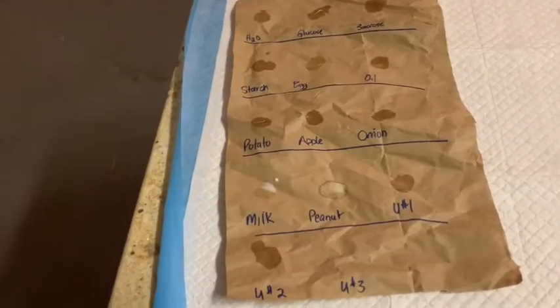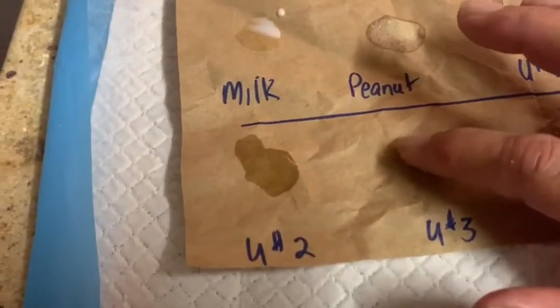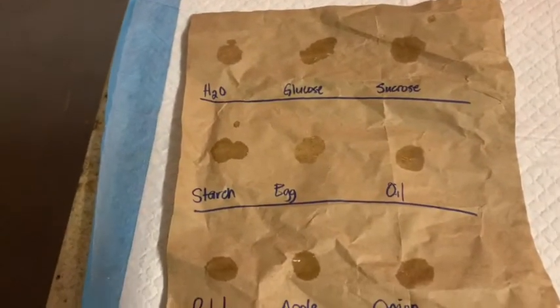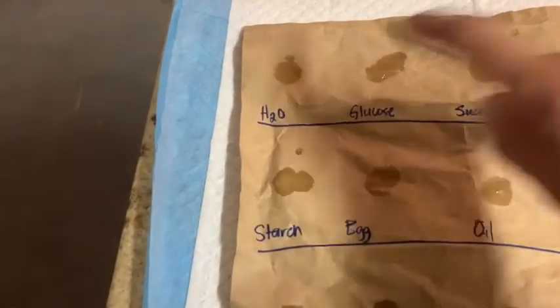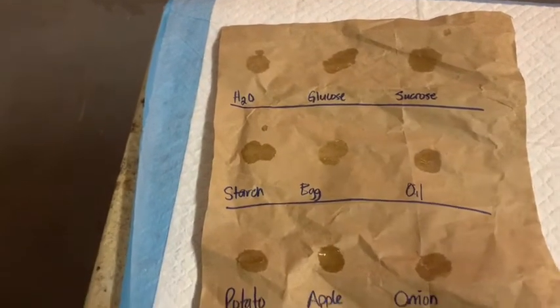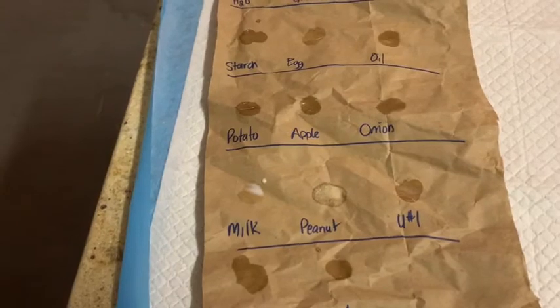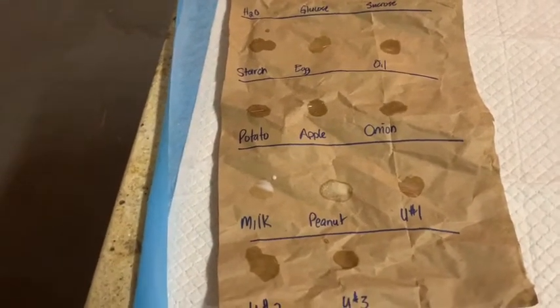All I'm going to do is spot some food products along with positive and negative controls and let them dry. I'm basically just taking my finger and dotting each food product right on the paper. We have our positive control, which is oil, our negative control, which is water, and all the other controls we've been using: glucose, sucrose, starch, and egg whites - plus all of our food products. We'll let this dry and come back to see which spot disappears, indicating no fat, and which spot becomes shiny.